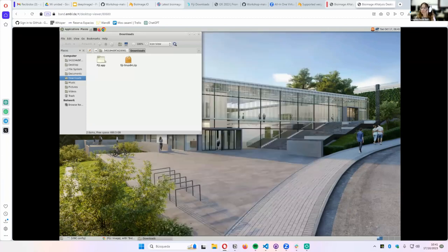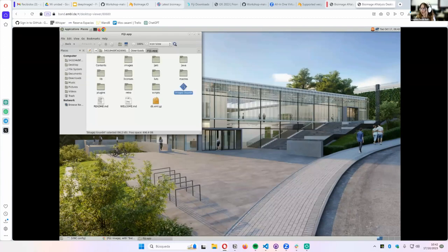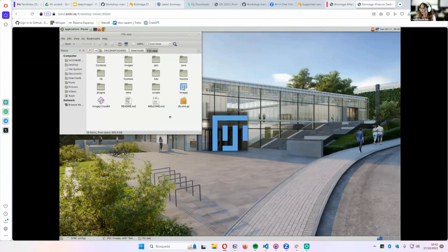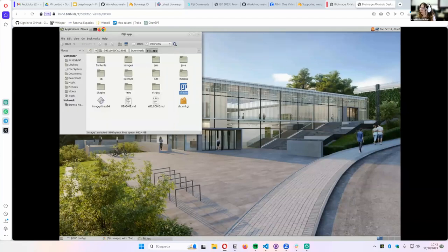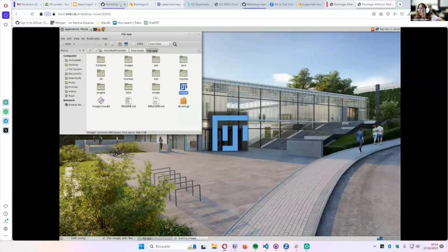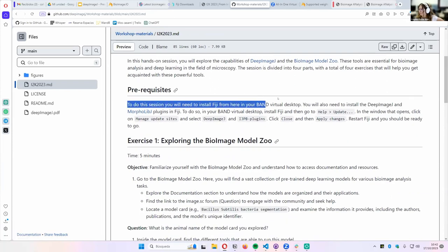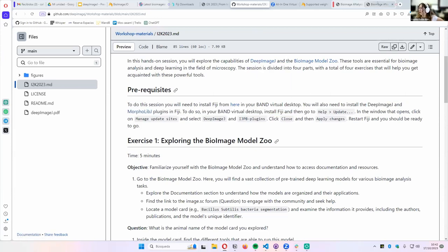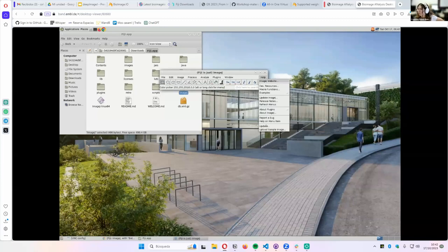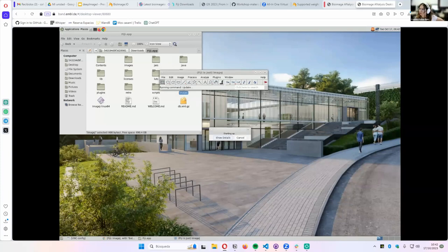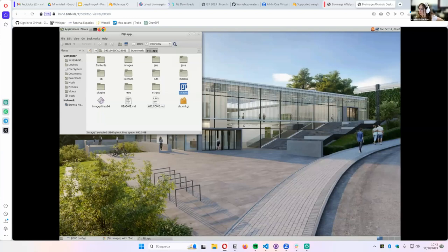It would be really useful if you do it at the same time as me. So, we have the Fiji download. What we first have to do is that Fiji doesn't come with all plugins installed. What we can do is update it. Remember that you have everything written in the guide. We need to first install DeepImageJ and MorphoLibJ plugins in our Fiji installation. The first thing to do is go to Help, then Update.